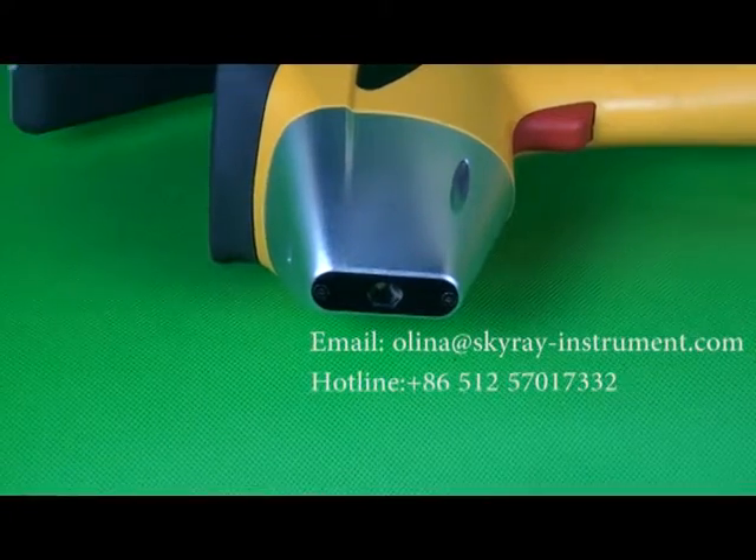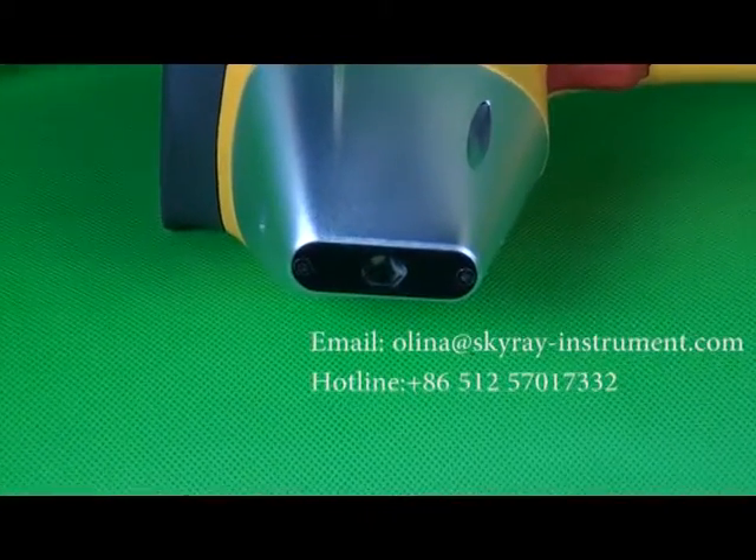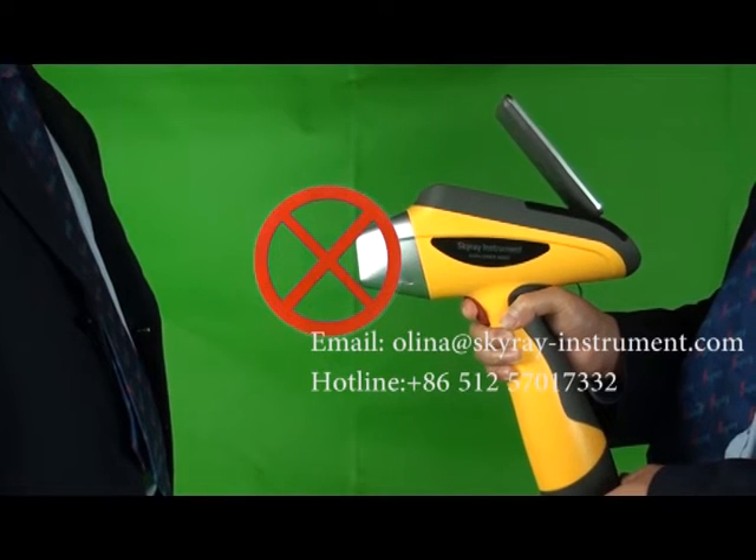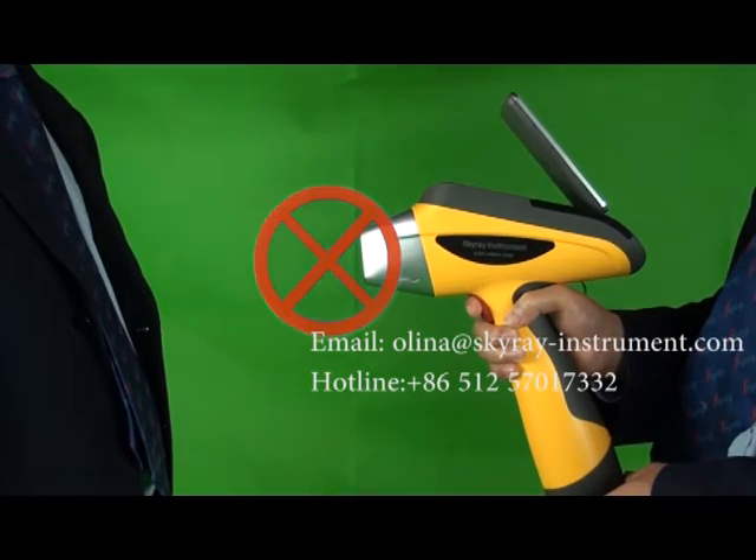Second, precautions for safe use of radiation. During testing, never target the device at other people in order to prevent any radioactive injury to them.